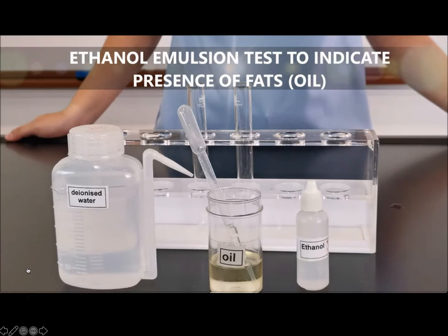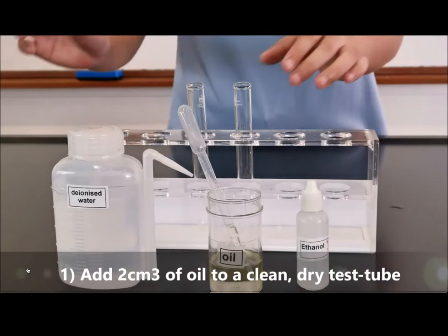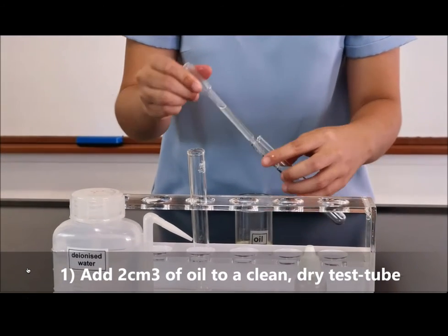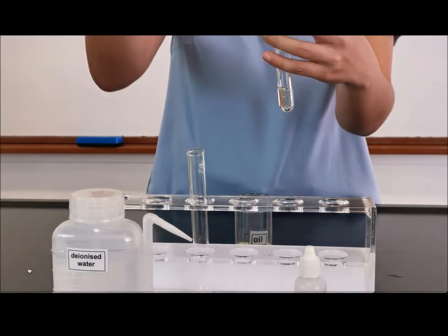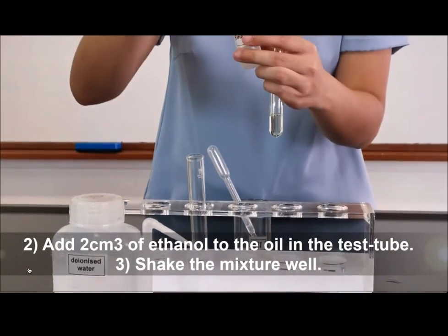Okay, this is the test known as the ethanol emulsion test, which is to test for the presence of fat. To a clean dry test tube, add 2 cm cube of oil. Add 2 cm cube of ethanol to the same test tube.